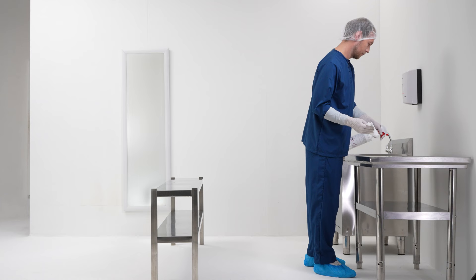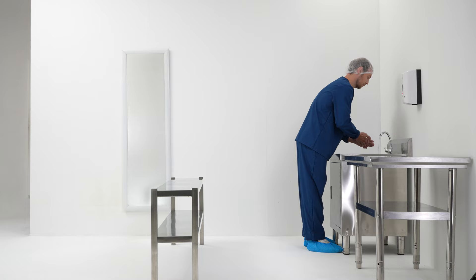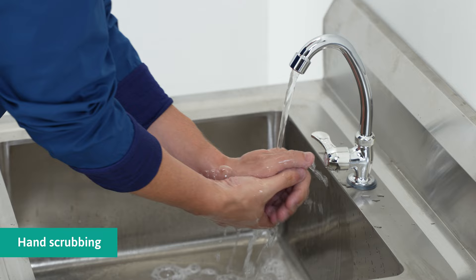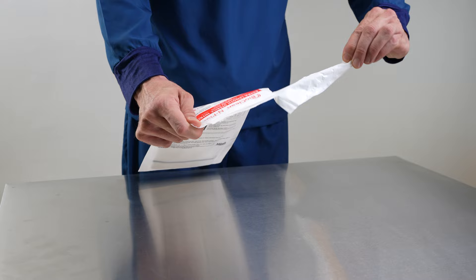Decontaminate the tabletop and bench with sterile wipes and alcohol. Use a new surface of the wipe for each wiping stroke. Bare hands need to be scrubbed prior to donning the first sterile gloves. Wipe down the packaging using the sterile wipes and alcohol prior to retrieving the sterile content.